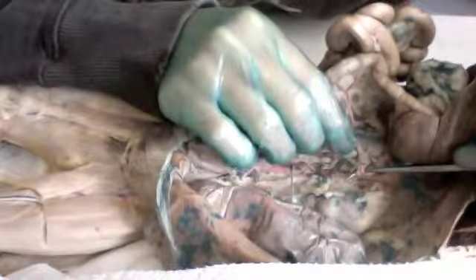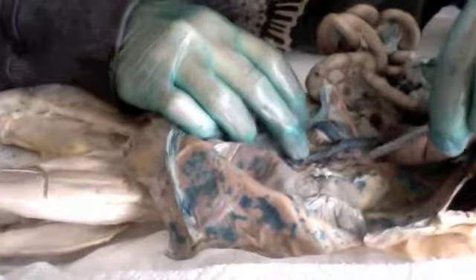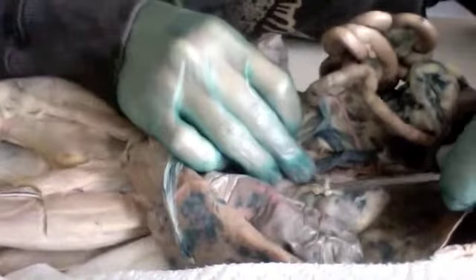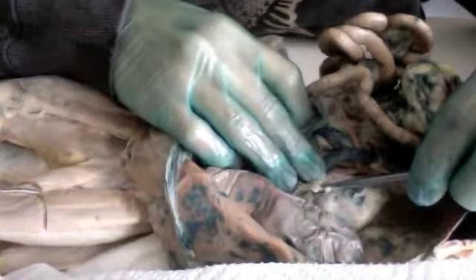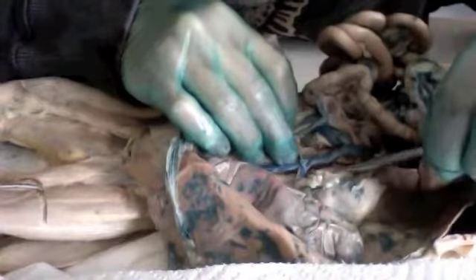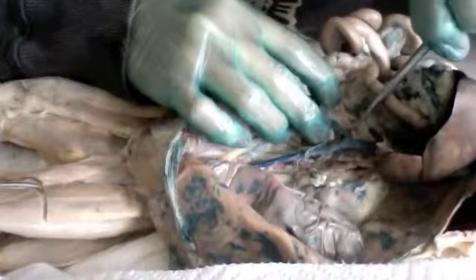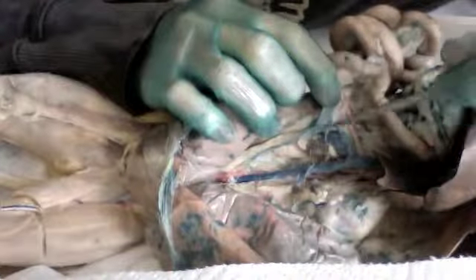Then we have the renal artery and vein, and there's two sides. There's a left side and a right side. I just actually split it trying to move this, but you can still see it. So this is the right side, renal artery, and the vein is here. And then the renal artery and the vein for the other side is here. You can see one and two. Split off right here, left and right. And the veins are directly above them.